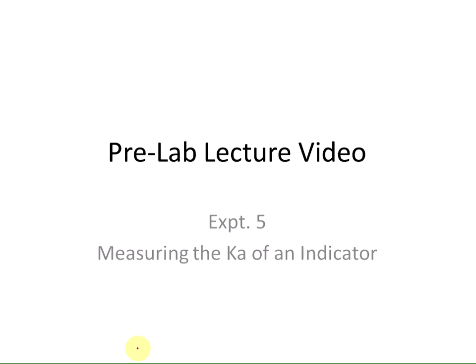This is a pre-lab lecture video for experiment 5, where we will be measuring the Ka of an indicator. Hopefully you remember from your lecture that an indicator helps to indicate what the pH of a solution is, and it does that by changing colors at different pH levels.